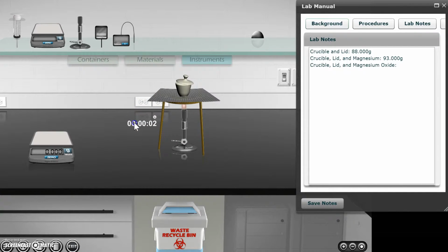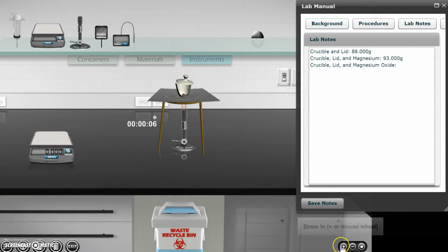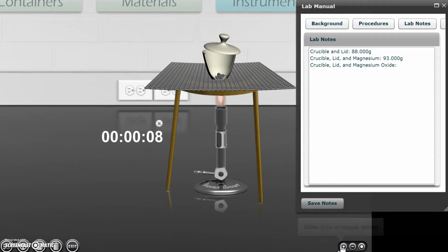We need a Bunsen burner to provide heat because in order for the reaction to start, we need activation energy. Activation energy is the minimum energy needed for a chemical system with potential reactants to result in a chemical reaction. The magnesium here is burning with oxygen found in the air. If you notice, the lid of the crucible is slightly open, which allows this interaction to take place. This is an exothermic reaction, which I will explain shortly.